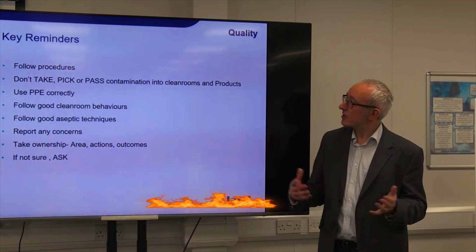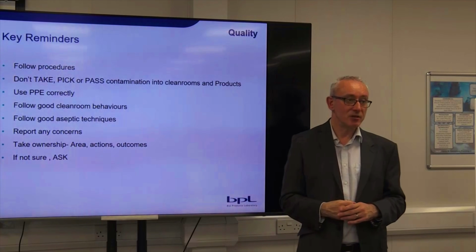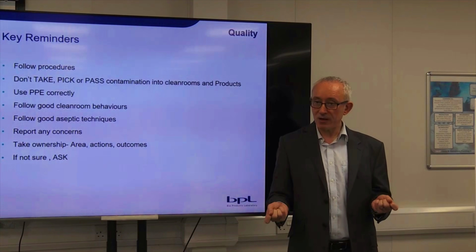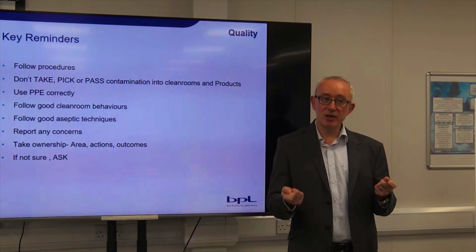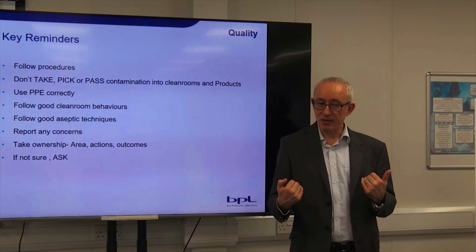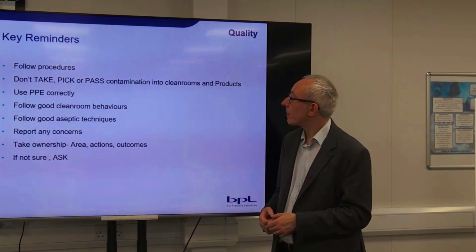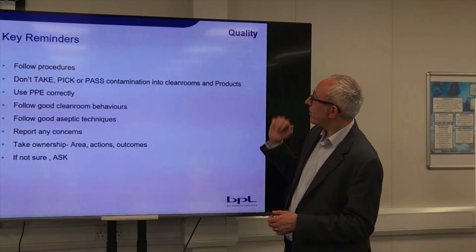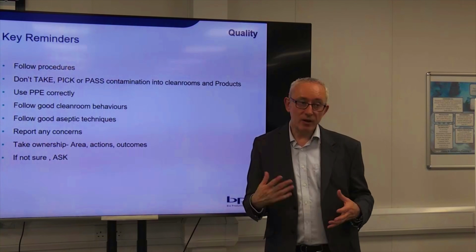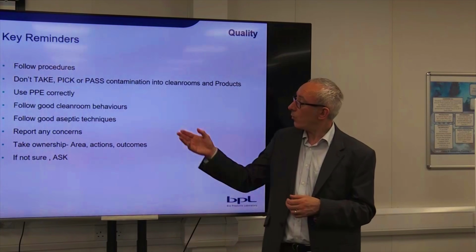Okay, so just to sum up, key reminders are: follow procedures. There's lots of documentation at BPL, there's lots of procedures to follow, but those procedures are based on best practice. They're designed to protect the product and the patient. Please don't skip any of the contamination control techniques. Always follow what we've done.